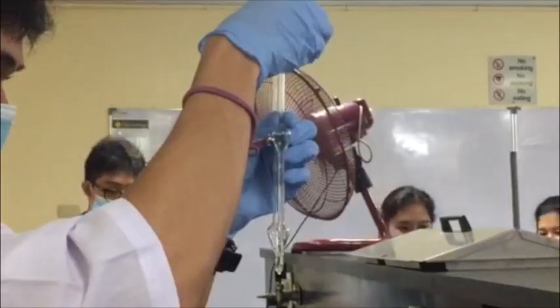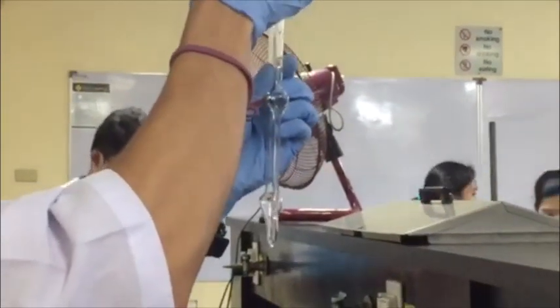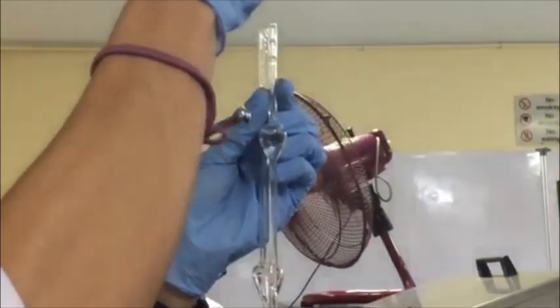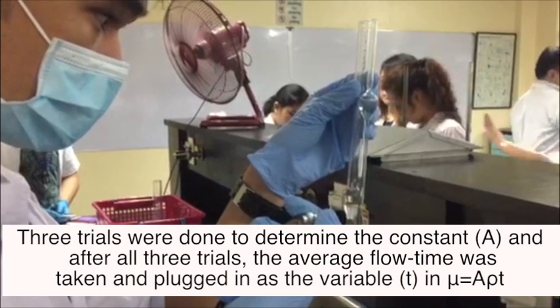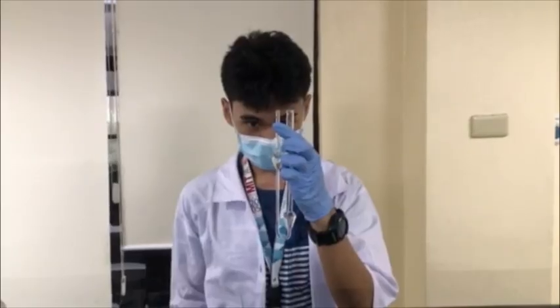Fluid is then vacuumed up the capillary past both the lower and upper mark using a suction bulb. Once past the upper mark, the bulb was removed and the fluid was allowed to run past the upper and lower mark, during which the researchers must record the time it takes for the fluid to complete its run.